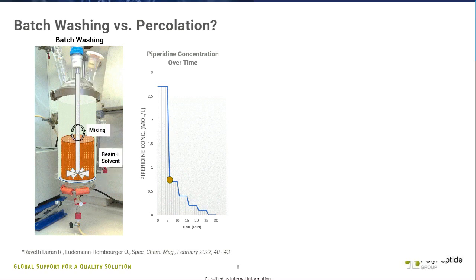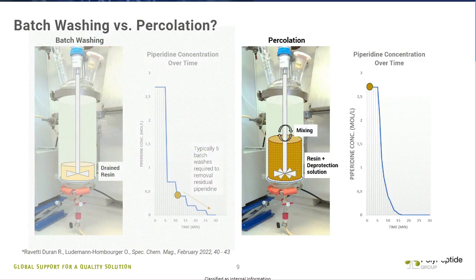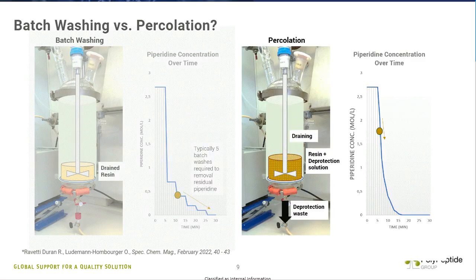So our idea was to improve this, and to do so, the idea was to perform what's called percolation. So we have our deprotection as standard. Resin and deprotection solution are together.